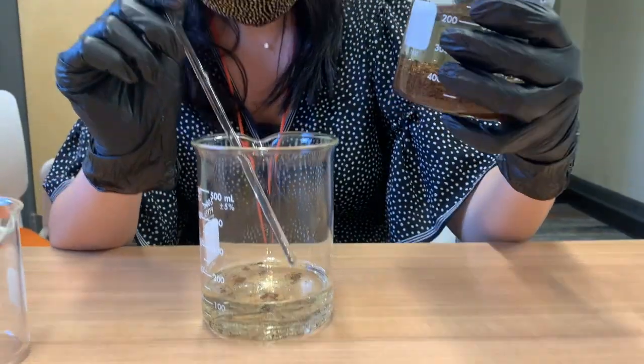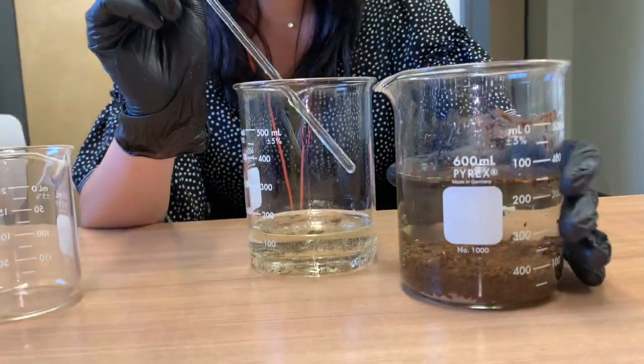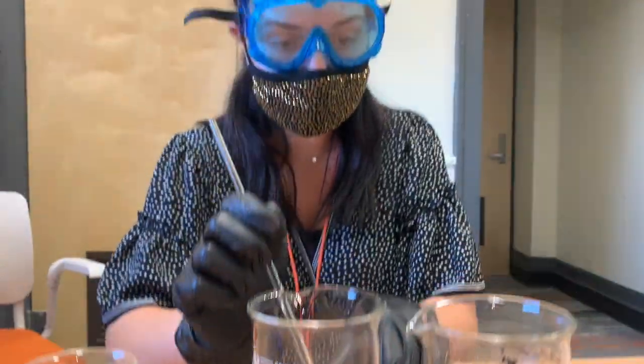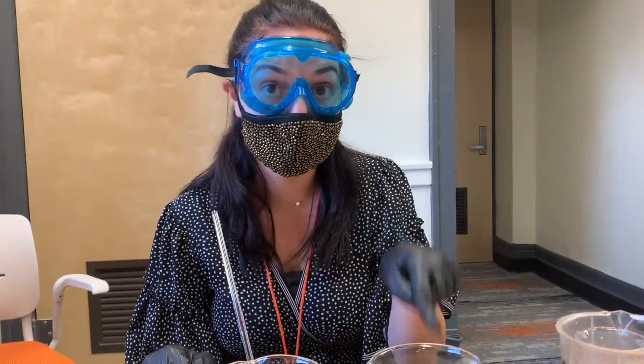Okay. Look at that. We have all the oil in this beaker, and we were able to separate it from the main beaker, almost as if we never poured it in the first place. So now what we're going to do is we're going to separate the dirt from the water.